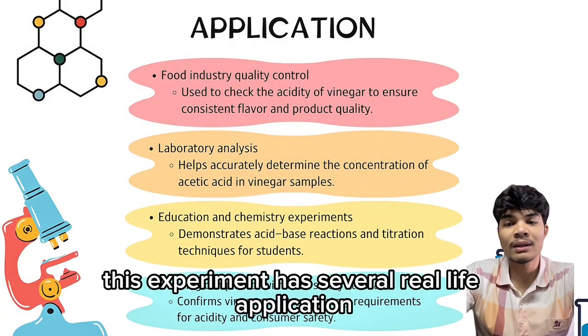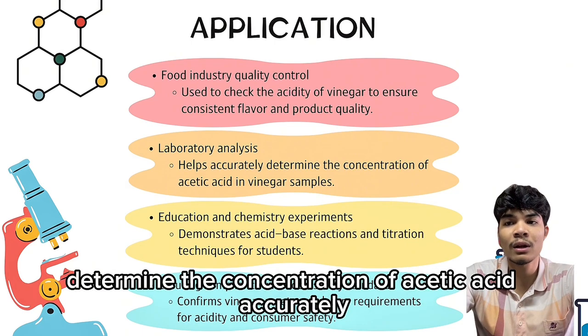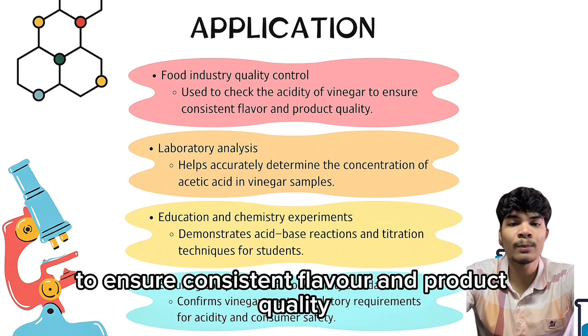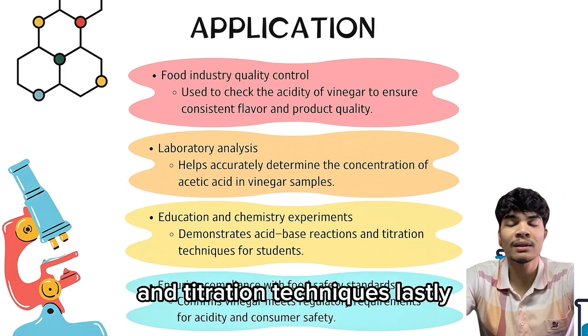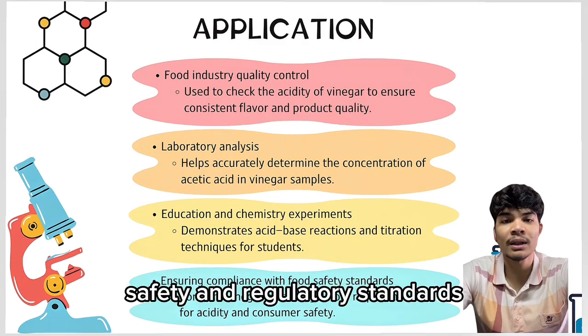This experiment has several real-life applications. In laboratory analysis, it helps determine the concentration of acetic acid accurately. In the food industry, it is used for quality control to ensure consistent flavor and product quality. In education, it helps students understand acid-base reactions and titration techniques. Lastly, it ensures that vinegar meets food safety and regulatory standards.